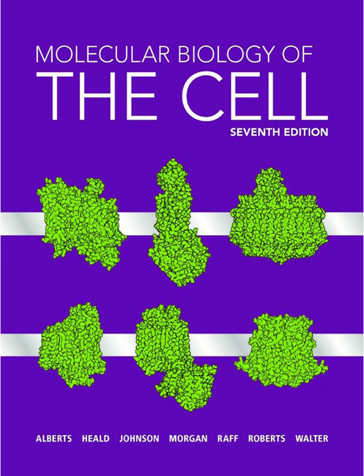Incredible progress. But even with all this, we still bump up against that 200 nanometer diffraction limit for resolving fine details, right? Many things in the cell are much smaller. We do. Ribosomes, viruses, cytoskeletal filament details, protein clusters, they're all smaller than the diffraction limit of light. Which is why super-resolution microscopy has been such an explosion in the last couple of decades. Okay, let's dive into super resolution. How did they break that barrier?